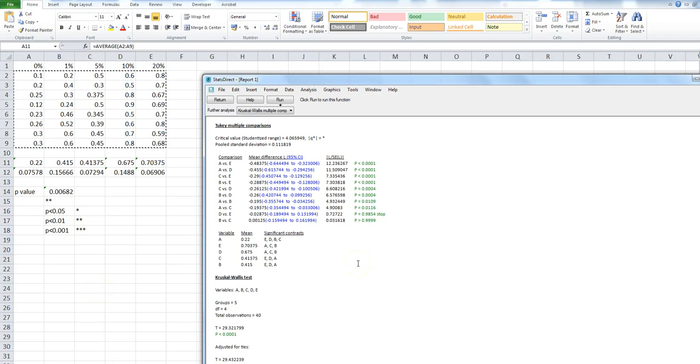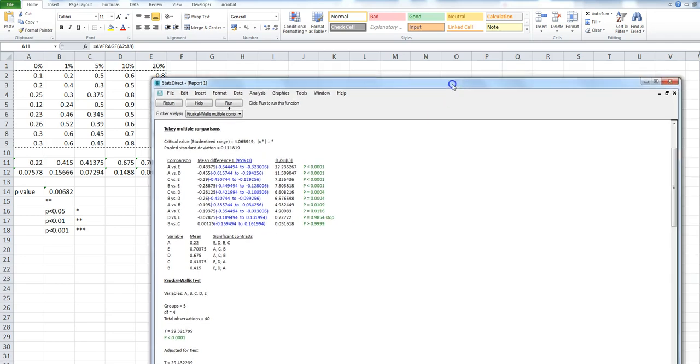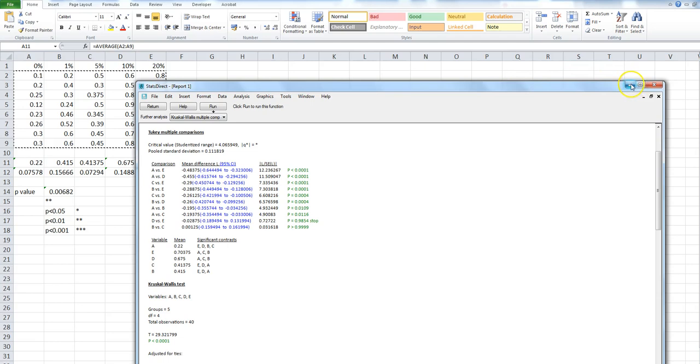So basically, you've got to draw a graph of your MTT data and your crystal violet data, two separate graphs, and annotate the significance stars for each of your data points on that graph. So I'll show you how to draw some nice pretty graphs up to my standard now.